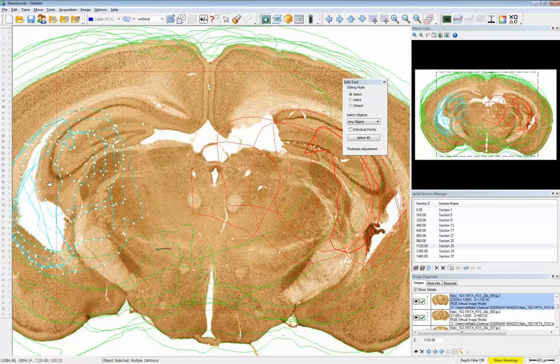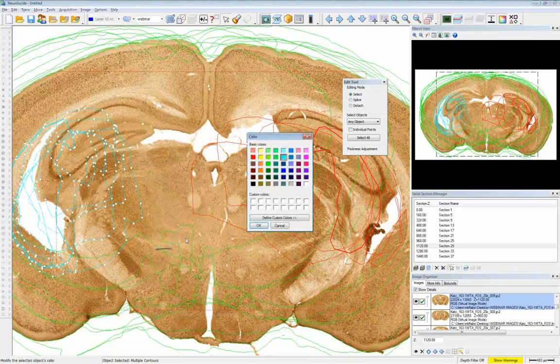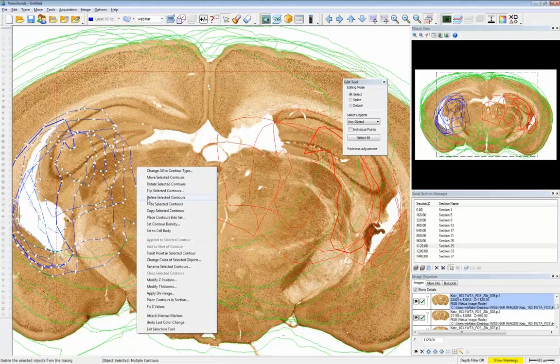That allows you to automatically select all contours or markers of that color, and now you can manipulate them all together. So if we wanted to change the color to royal blue, we could do that. Well, that's a lot easier than having to go through and click on each one individually. Oh yeah, especially when they're not so nicely organized. If you've got aqua all over the place, you spend a lot of time trying to hunt and peck for those individual options.